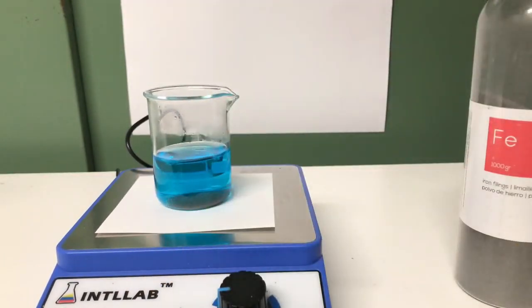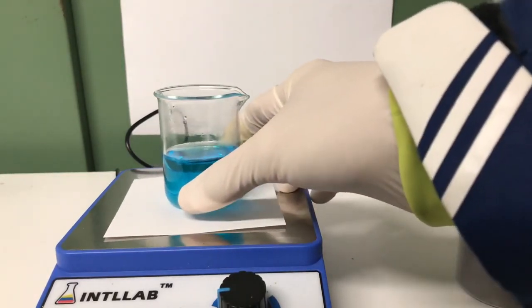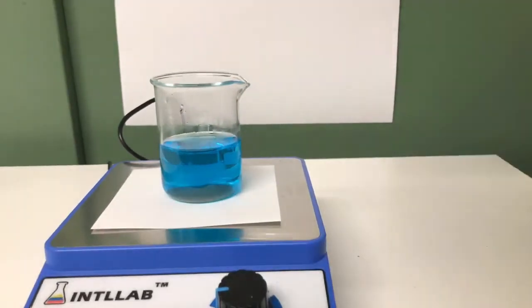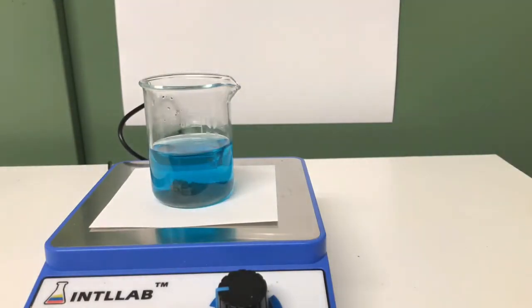You are now able to see that our solution is even stirred when we remove the stir bar because the iron fillings are getting moved by our rotating magnet in the stirring plate as well.